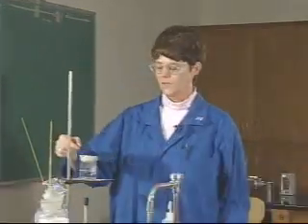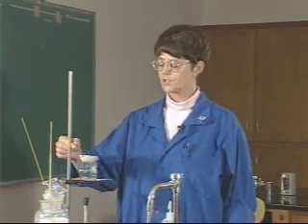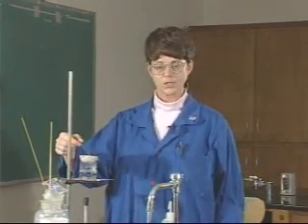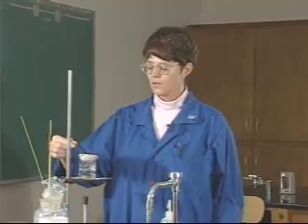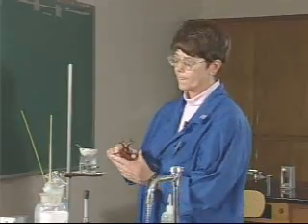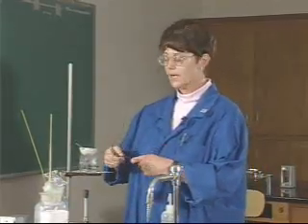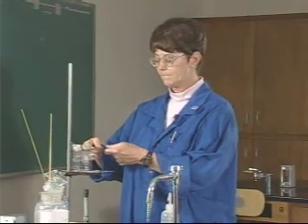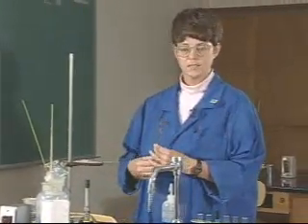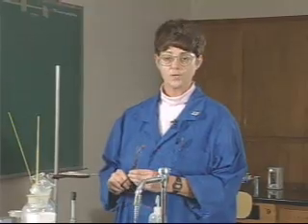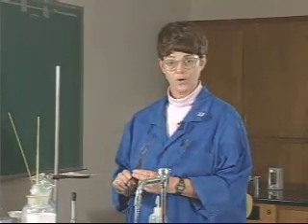Check the evaporating dish. Before you complete the third part of Section B, you need to return to the evaporating dish from Part A, because you're going to need some of the hot water from the hot water bath. Check and see if all the water has evaporated from the salt solution — and in this case, it has. If you find that that's the case, then you want to remove the evaporating dish from the beaker. I'm first going to take the entire beaker off and put it onto a hot pad.